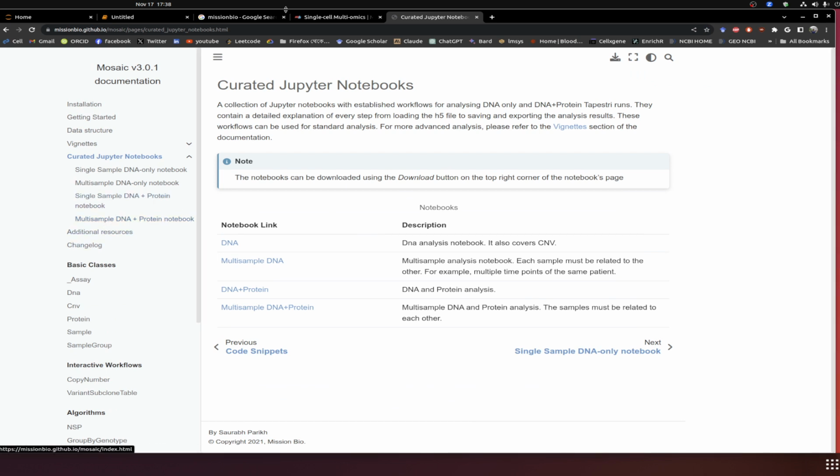Either way, as I go through this data analysis step by step, I'll show you a complete tutorial with an explanation of each step on how to perform the bioinformatics part and optimize it in a perfect sense to find our biological interpretations, or what we are looking for from the biological perspective.